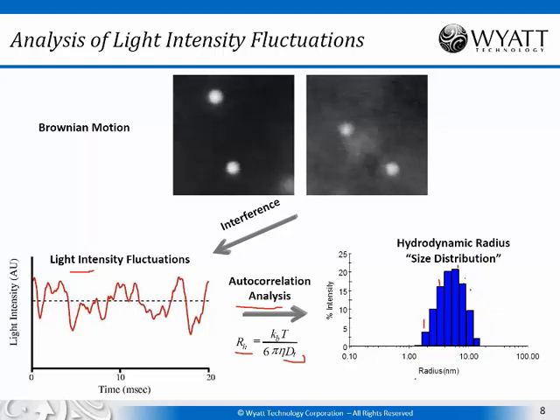And you can see that the scale for the radius here is logarithmic, varying by several orders of magnitude. And so the size distribution is not highly quantitative, but it is pretty robust, and we'll discuss soon how robust a size distribution you can expect, and also what you can do in order to obtain higher resolution size distributions.